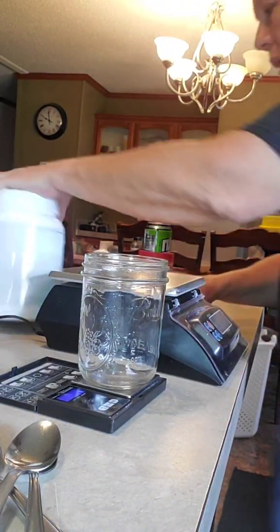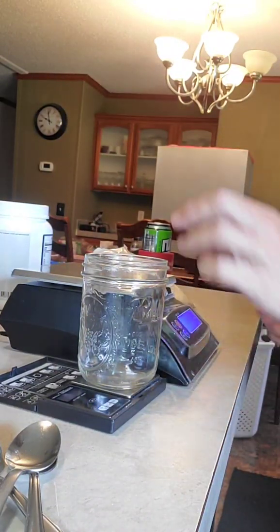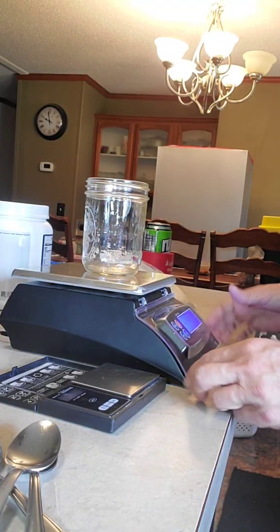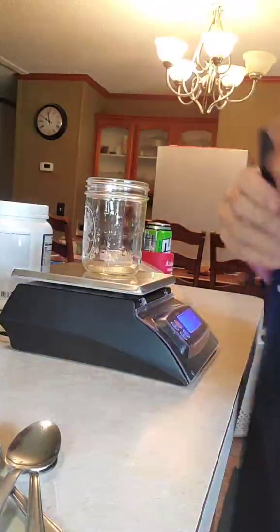Same thing with this one. Make sure everything's zeroed out. There we go. This is going to need to be set to grams. No. Scooby-Dooby-Doo! There we go. We're on grams. Yeah, this one already crapped out on me. There you are. All right. So, we're zeroed out.